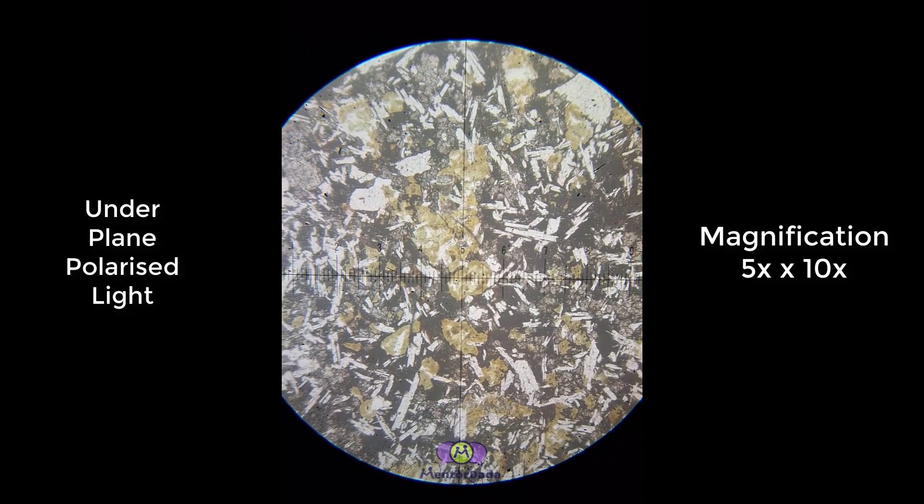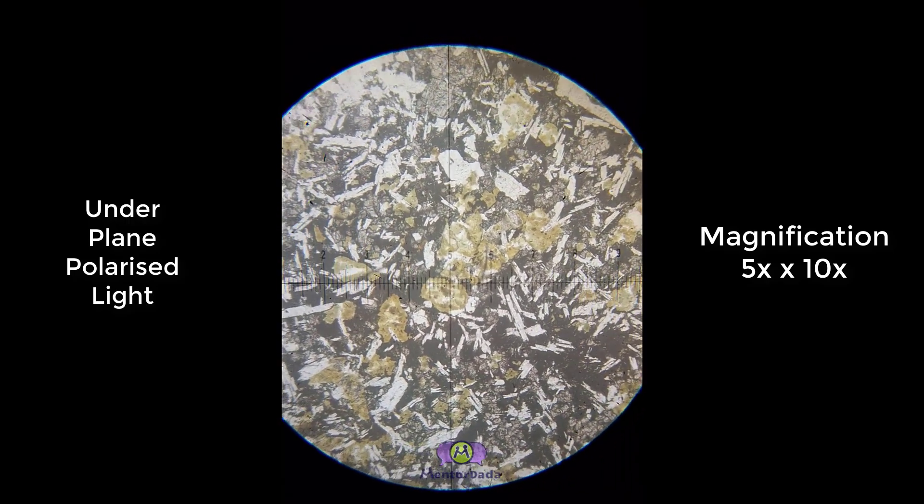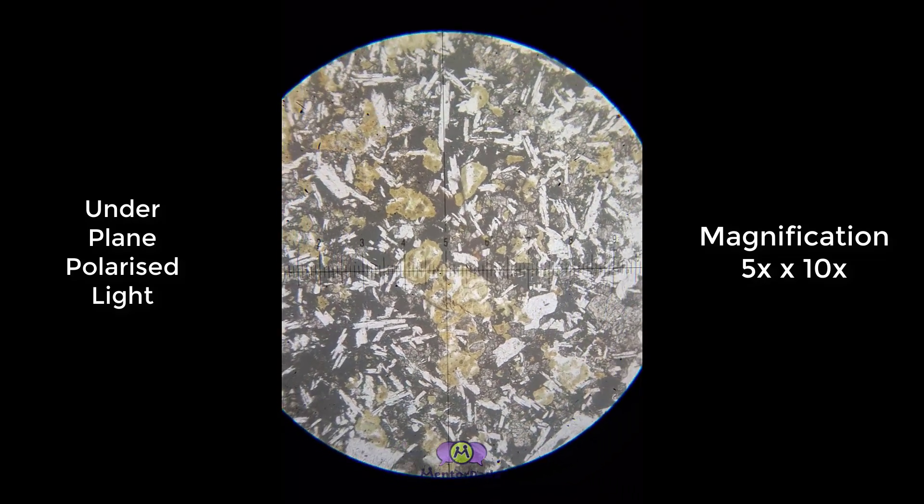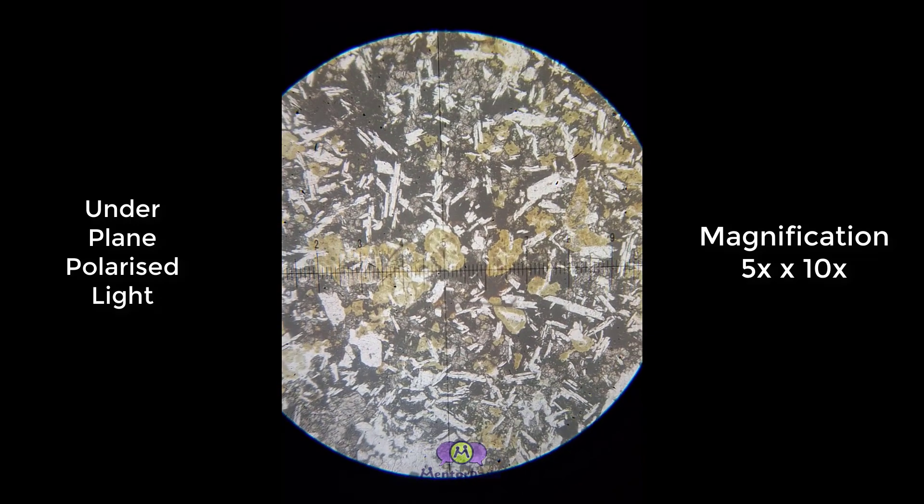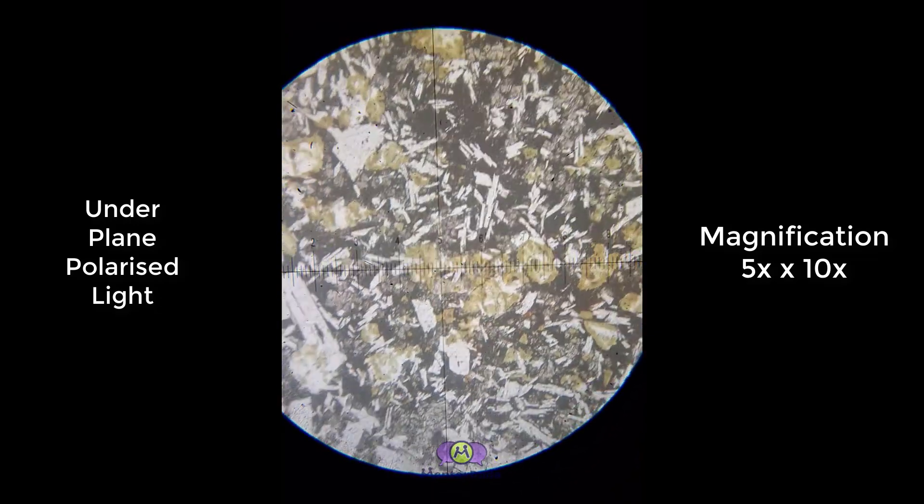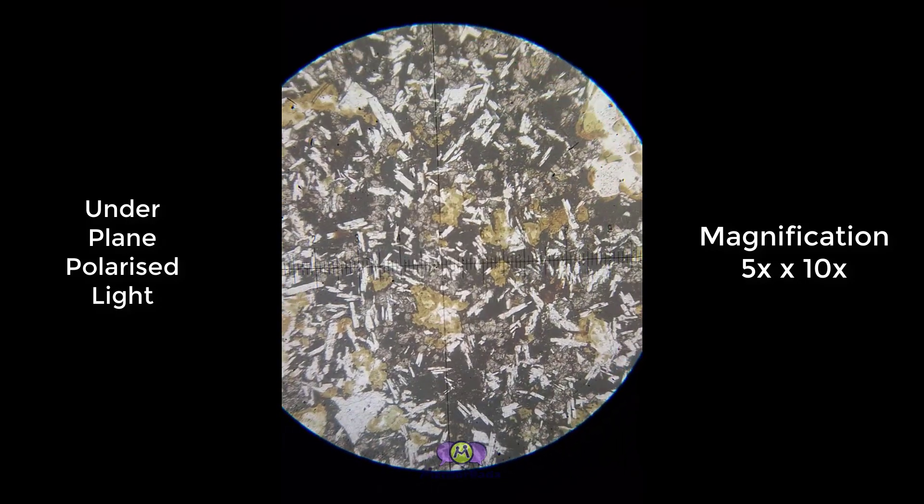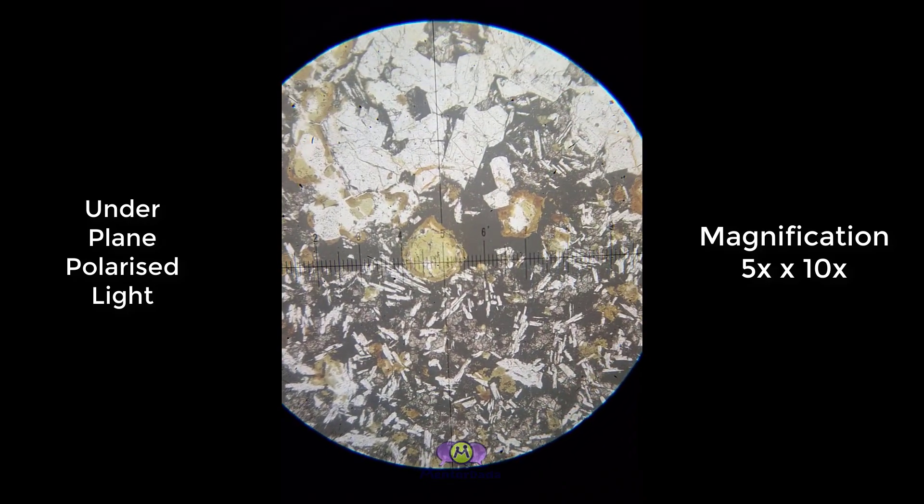Hello everyone, welcome back to Menta Dada. Now I am showing a rock and this is definitely an igneous rock. At this location you are observing some yellowish or greenish patches.